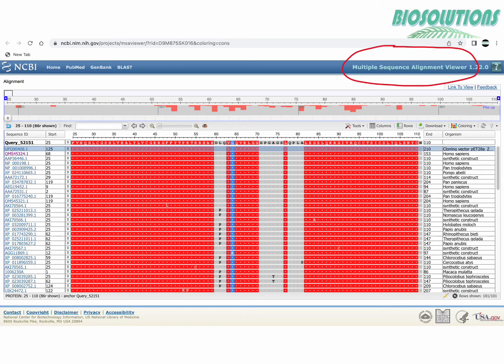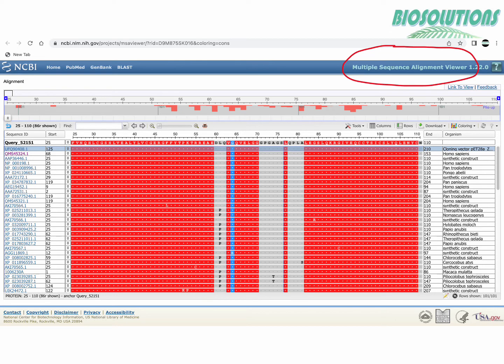Multiple sequence alignment viewer or MSA viewer is a graphical display for the multiple alignments of nucleotide and protein sequences.